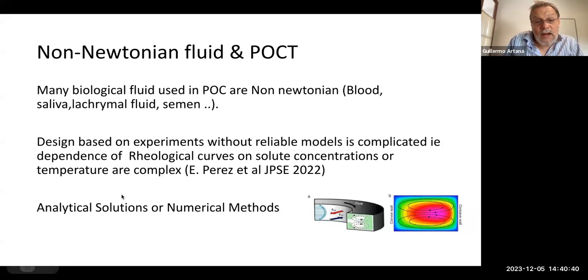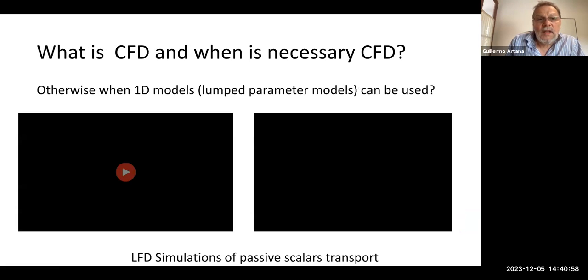When you are facing problems in which you have non-Newtonian fluids, you should go to analytical solutions or numerical methods. These are allowed more for channels in which you know the geometry and you can integrate the equation easily.